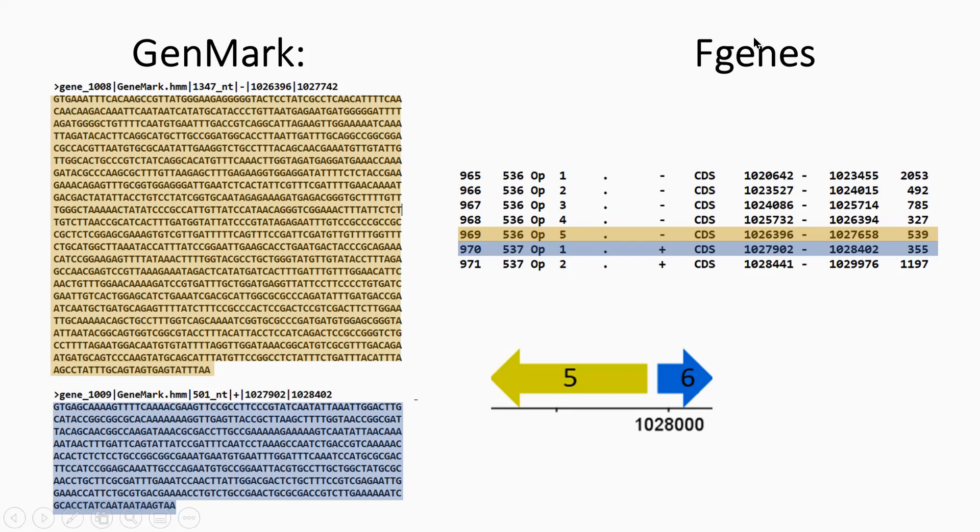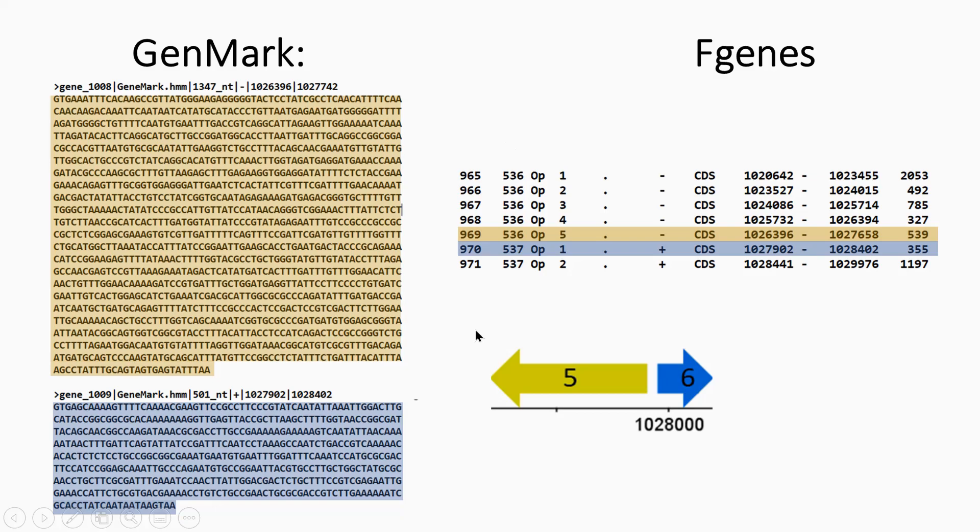Same for FGenesB, as well. And these are considered, actually, to be very good prediction programs. I think FGenes is probably one of the best. But you can see here, the start coordinate here is the same between FGenes and GenMark. I was quite happy about that.